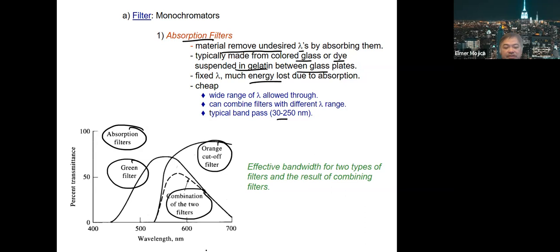Okay, so if you're going to use it at a certain wavelength, kaya niyang i-cut off yung filter na yan. Usually yung kina-cut off mong wavelength is lower. Why? Bakit kaya lower wavelength or shorter wavelength yung kina-cut off mo? Anyone? Because they are the one that is higher energetic. Okay?